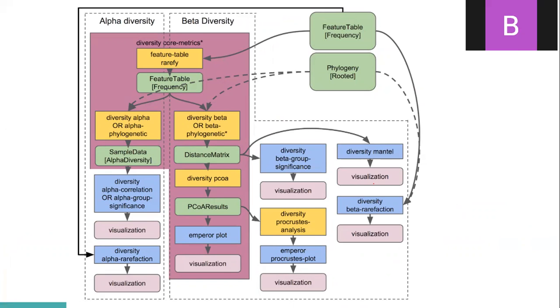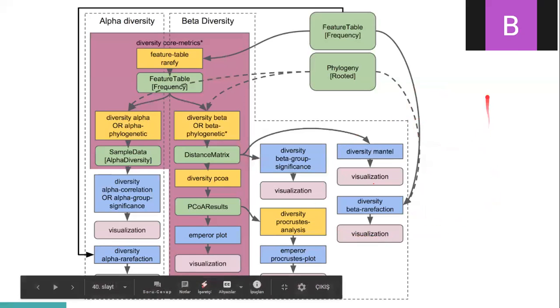The metadata columns, like humidity and temperature, are they related to each other or not? It is used for that, and we followed this pipeline, as you see here.